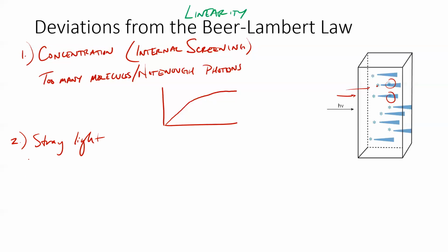And if we have more light, how is that going to affect our curve? This was one of your questions on the lab. If you have, I mentioned it's more powerful, but go ahead, Baja. Okay, so like more intensity, doesn't that reduce the effect of the deviation of stray light on the transmitted? Absolutely, absolutely. If we have a more powerful lamp, so let's say our lamp is 50 watts or something, the amount of stray light that gets in is going to be much less than that, and so it's going to cause much less deviation than if we had a 7-watt lamp.